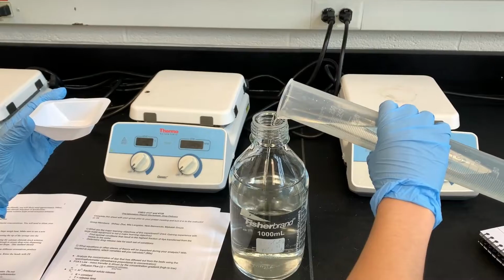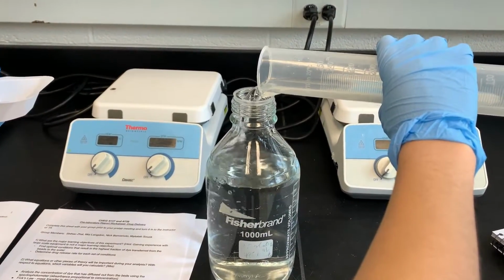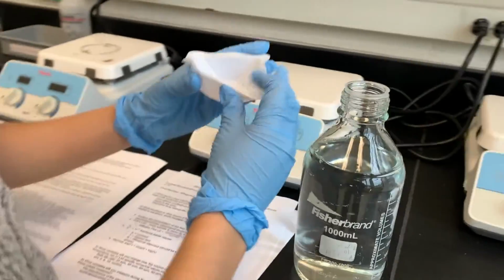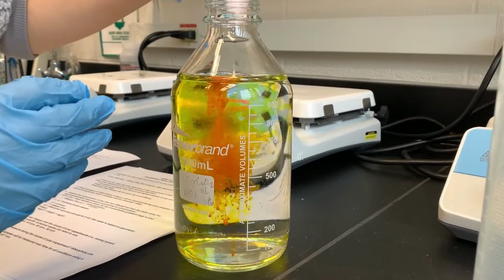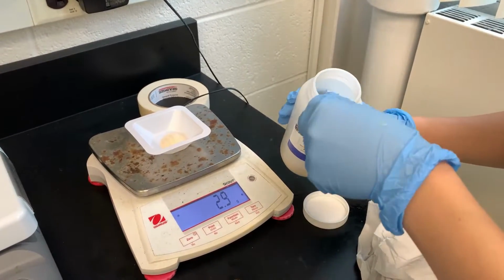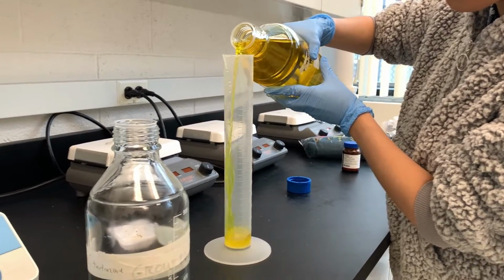To begin, we first make a 1 liter solution of 0.5 grams per liter tartrazine by adding 0.5 grams of tartrazine into 1 liter of water. Next, we measured out about 3 grams of sodium alginate and 300 milliliters of the tartrazine solution we just made.